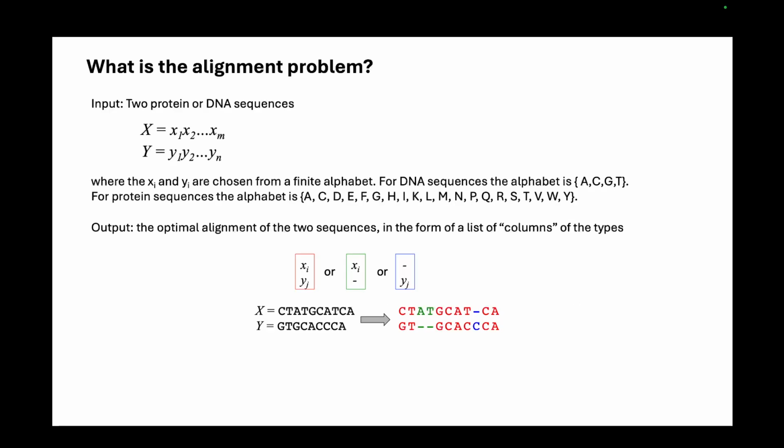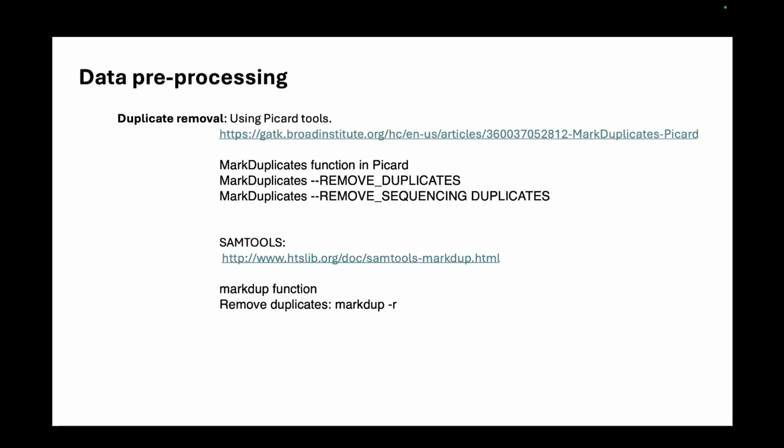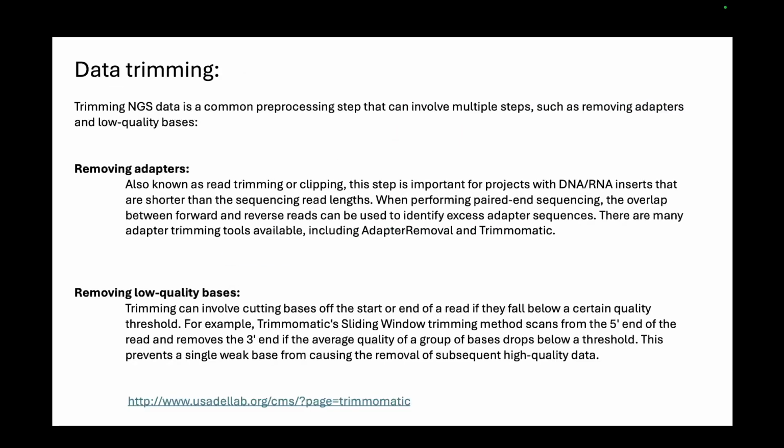Okay, so this part brings us to the end of the first step of pre-processing. We started with Sanger. We then moved on to Illumina, then different types of long read, including ONT and PacBio and different stuff. That was how you read the bases, how you generate the sequences. Then there will be a base caller that will identify the signals inside these sequencing platforms and generate the reads. After the reads have been generated, you use software like FastQC to check if the data is good quality or not. If not, you do some preliminary QC like removing low quality bases, removing adapters inside your data, or removing duplicates.